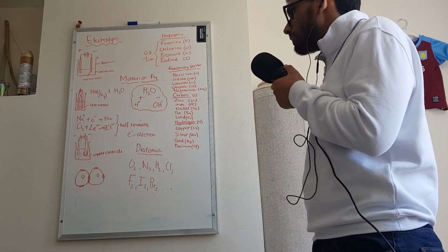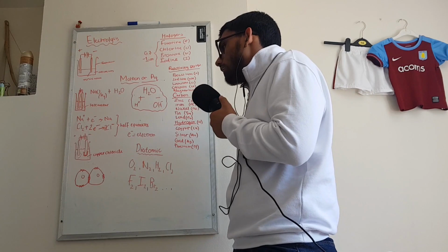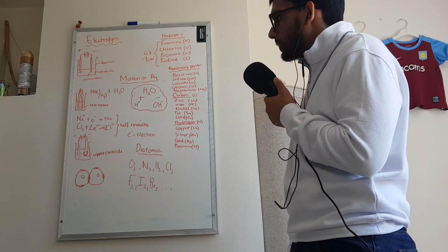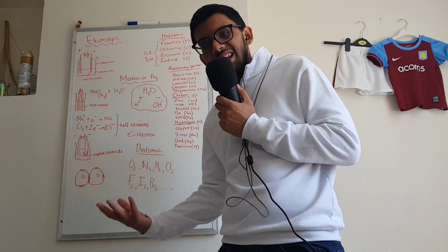It's a pretty simple rule. It's just what's left in the water will react with what's being produced. Now, what about in the case of the copper chloride? Well, both the chlorine and the copper are being released outwards, so there's not really anything left to react with.